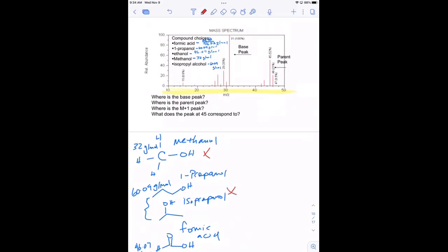Do you see how, again, if I'm looking for a specific compound and I know the mass of it, and I take the mass spec, and if it's 200 grams per mole and the spectrum stops at 150, that compound can't be in there. Are you following? If I have a sample and I'm injecting it and assuming that this 200 gram per mole compound is there, and then when I take the spectrum of the sample it stops at 150, that tells me that compound is not there, right? Because the spectrum has to include the mass of your sample, whatever it may be. So those two are ruled out.